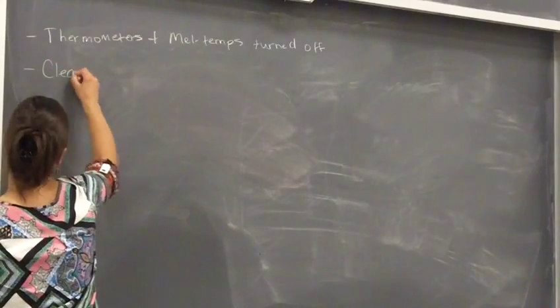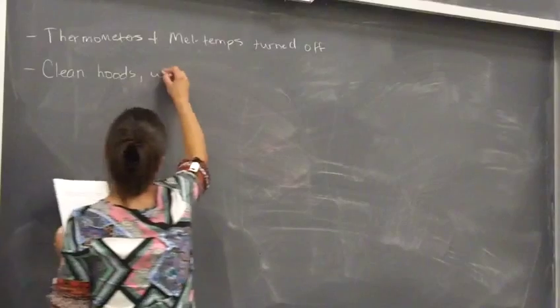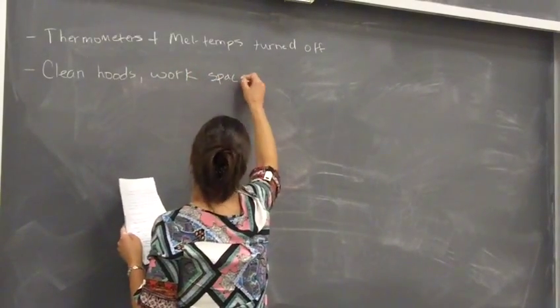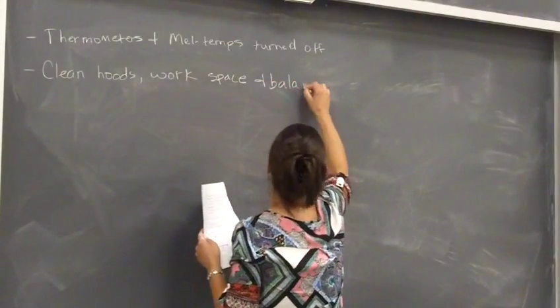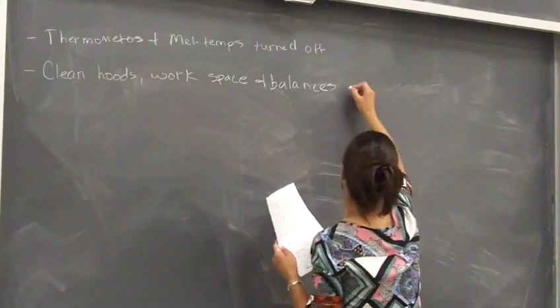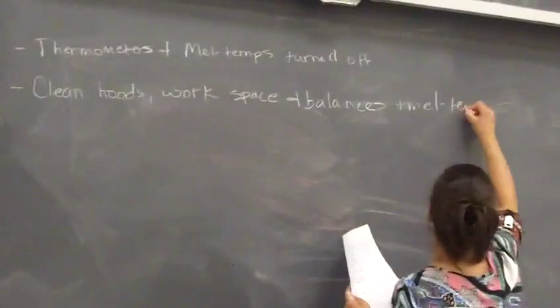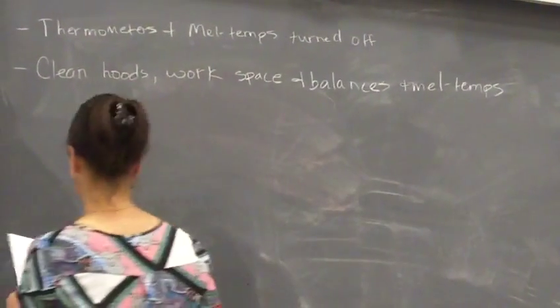Make sure you clean your hoods and workspace and balances and melt temp area after you're done using that area, whether it's in your lab time or in open lab time, okay?